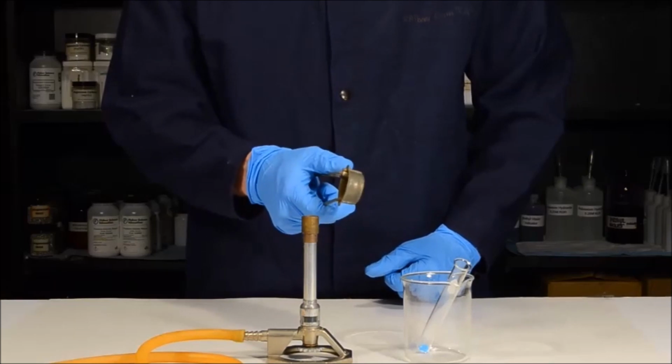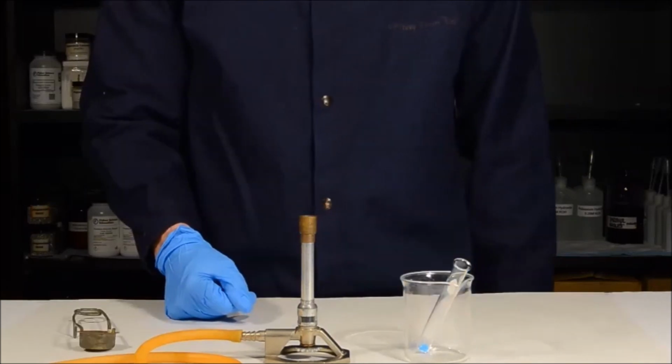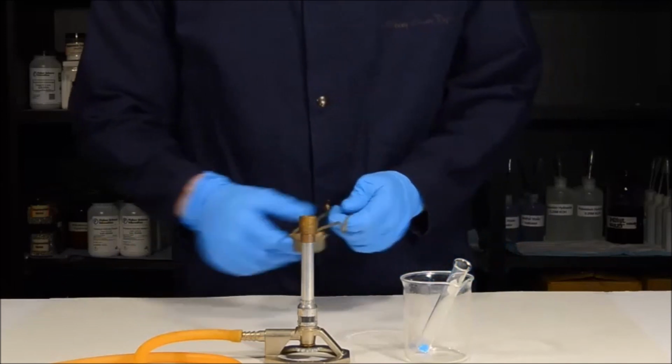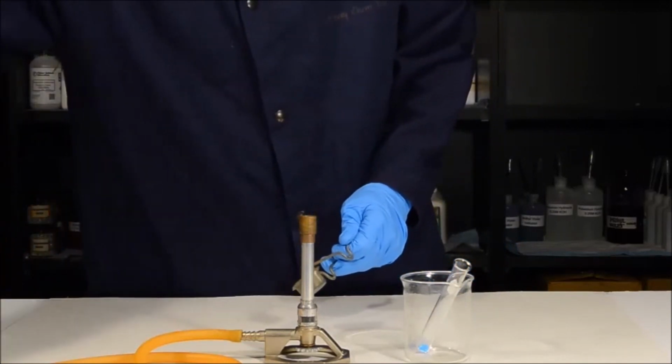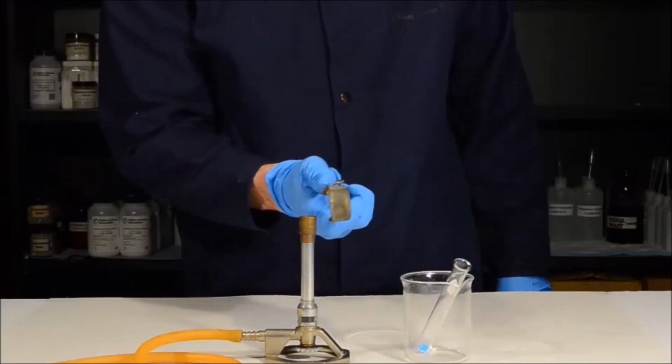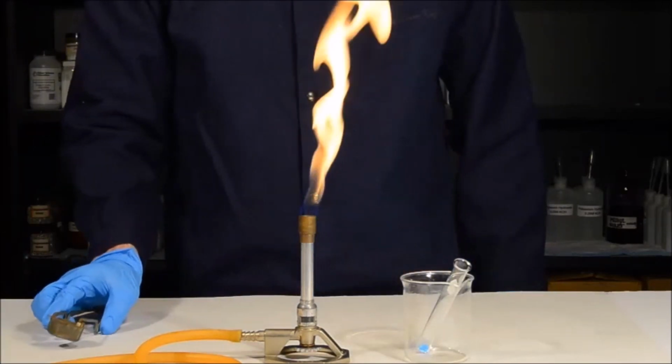Once you can get sparks, you're ready to turn on the gas. Now that you have the Bunsen burner ready to go, and the sparker is working, it's time to turn on the gas. To do this, at the bench, simply turn the gas on all the way. Once the gas is on all the way, light it like this.